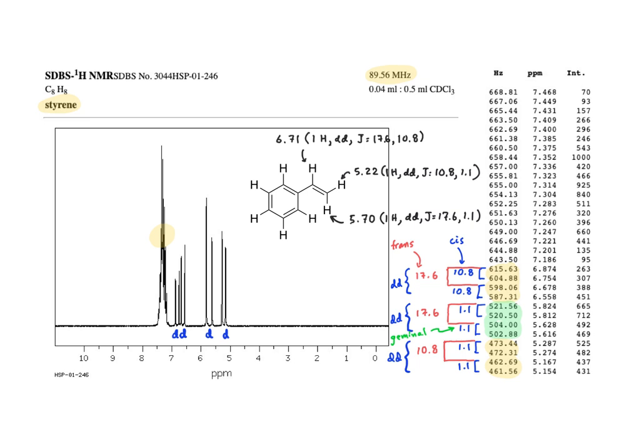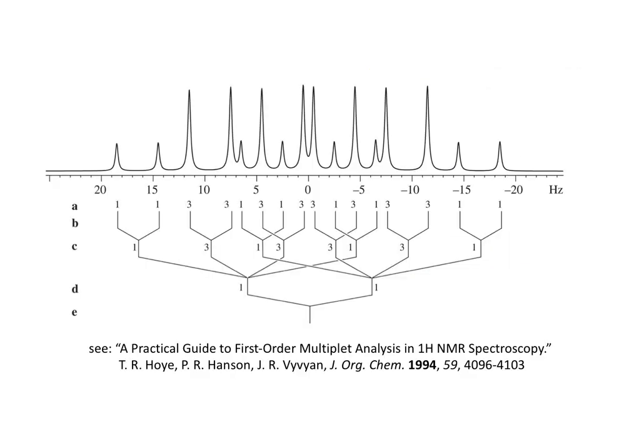I hope that was pretty straightforward. But now let's go to a case that is not uncommon in my lab and probably in many of your laboratories. This multiplet is depicted in figure 3.26 on page 143. This is probably a simulated multiplet because of the nice sharp peaks, but this is a good place to start. I'll talk in a moment about how we come up with all of these couplings that are shown below here.